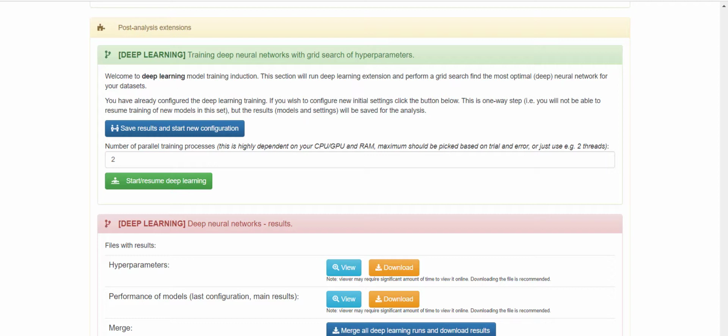You can use autoencoders or not, but generally the neural networks generated are feed-forward neural networks with up to 3 hidden layers and with different hyperparameters as shown later and in the documentation.